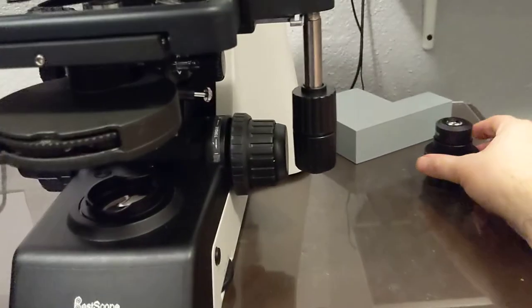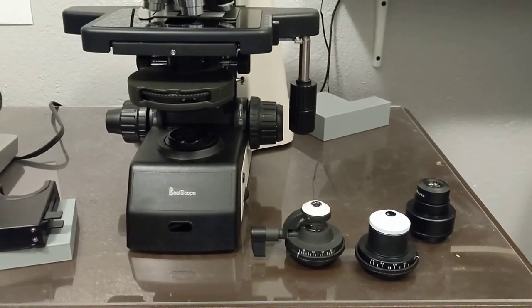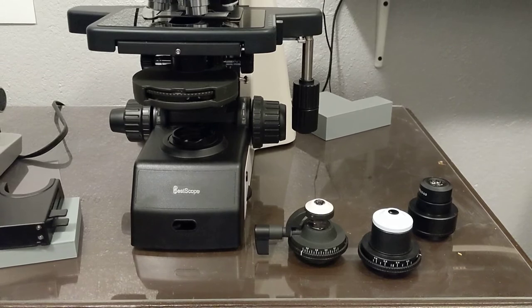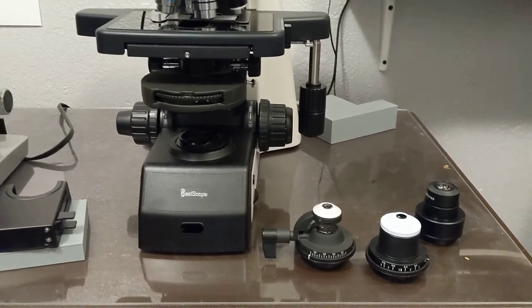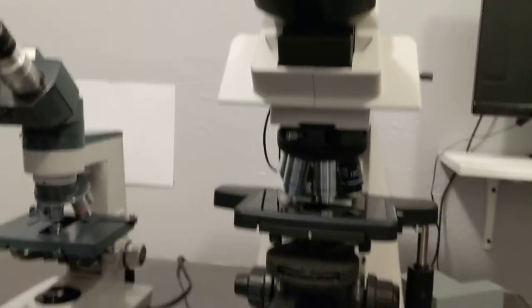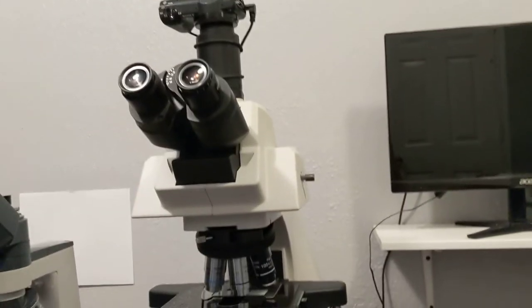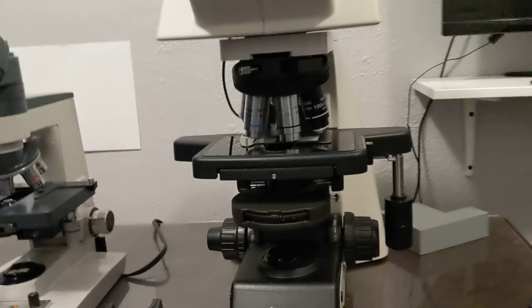This is a dark field condenser, and it works really nicely. It works for the lower magnification objectives. I have the oil, the high power dark field condenser on its way, but it hasn't arrived yet. Shipping time between paying for it and it arriving is something like two months, maybe just a little bit more. Be prepared for a wait. Some patience is required.